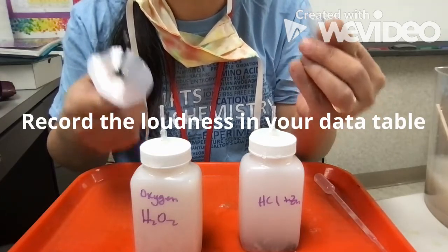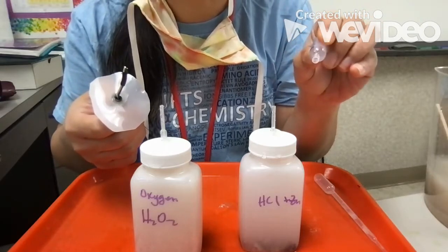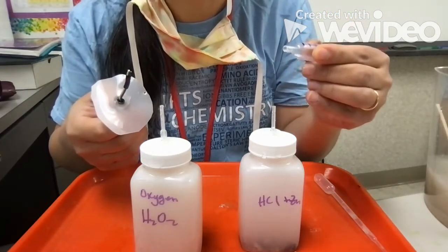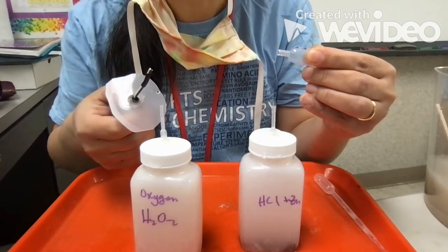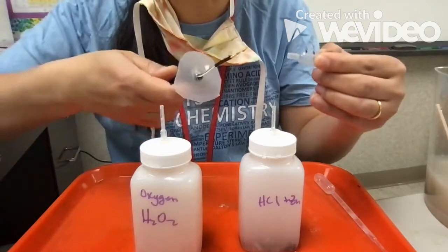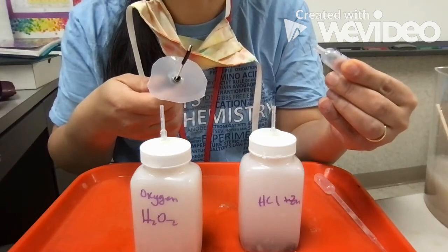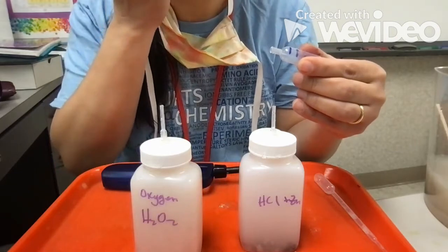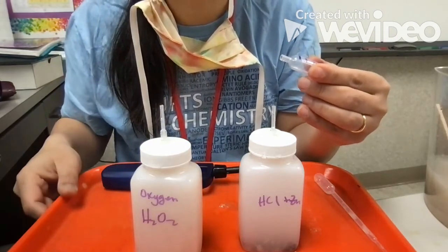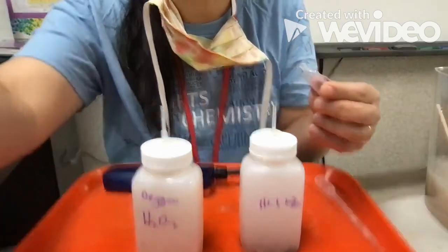And so on a scale of 0 to 10 now, you're going to write down how loud you think that sound was, okay? And so the other thing is, maybe your partner can spark this and the other person can hold on to the rocket. All right, so that is the lab for today. So you'll do several mixtures, listen to the loudness of the sound, and then record your results on the table. All right, if you have any questions, let me know.